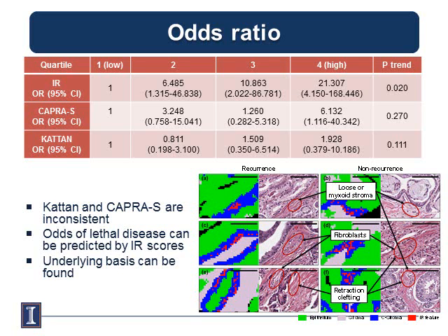But what is more important is we can give two pieces of information that are not available in the clinic right now. The first thing we can do is take this integrated IR imaging approach and provide an odds ratio. So if you're in the low risk group, let's say your odds of getting prostate cancer are something, but if you're in the high risk group, we have a 20-fold higher chance of having lethal prostate cancer if you're classified by IR microscopy. The best clinical tools give you a 6 and a 2-fold roughly chance of getting between the high and the low group.